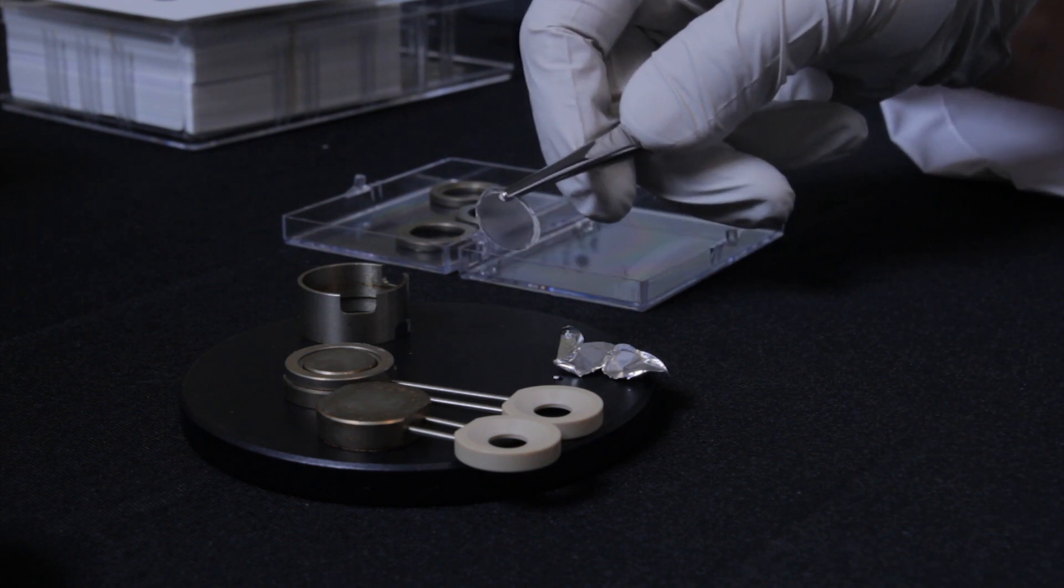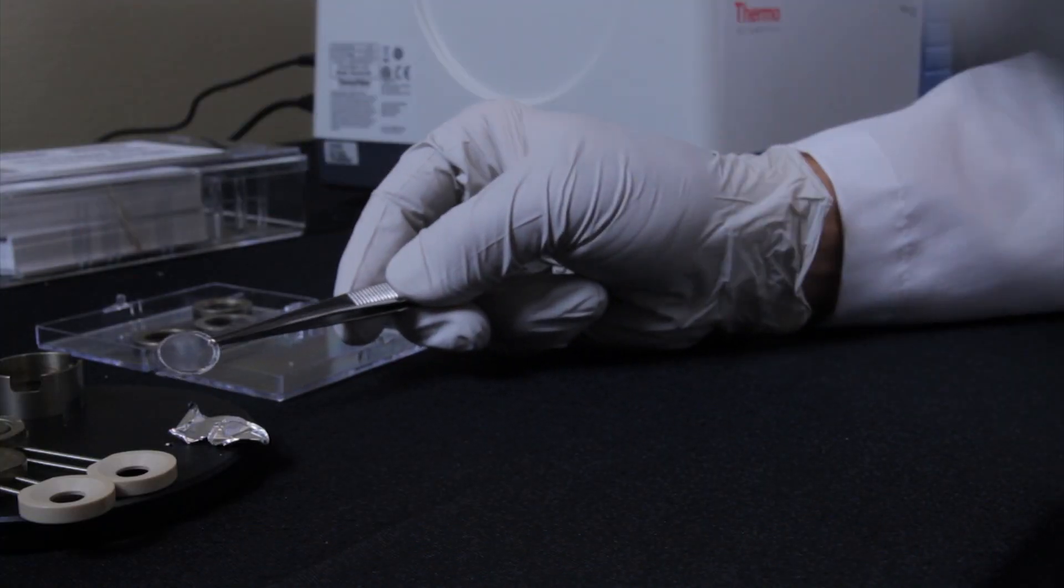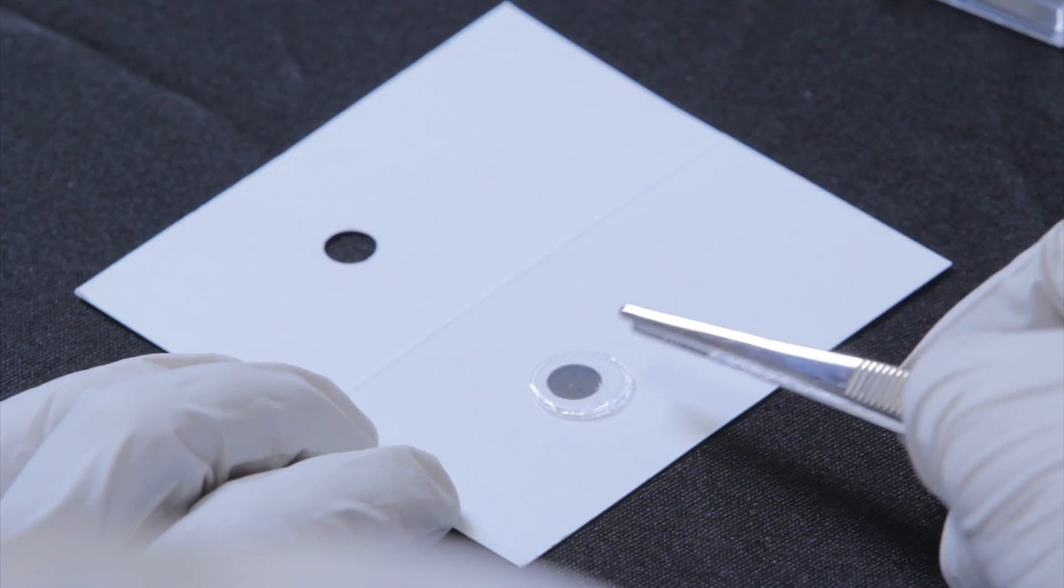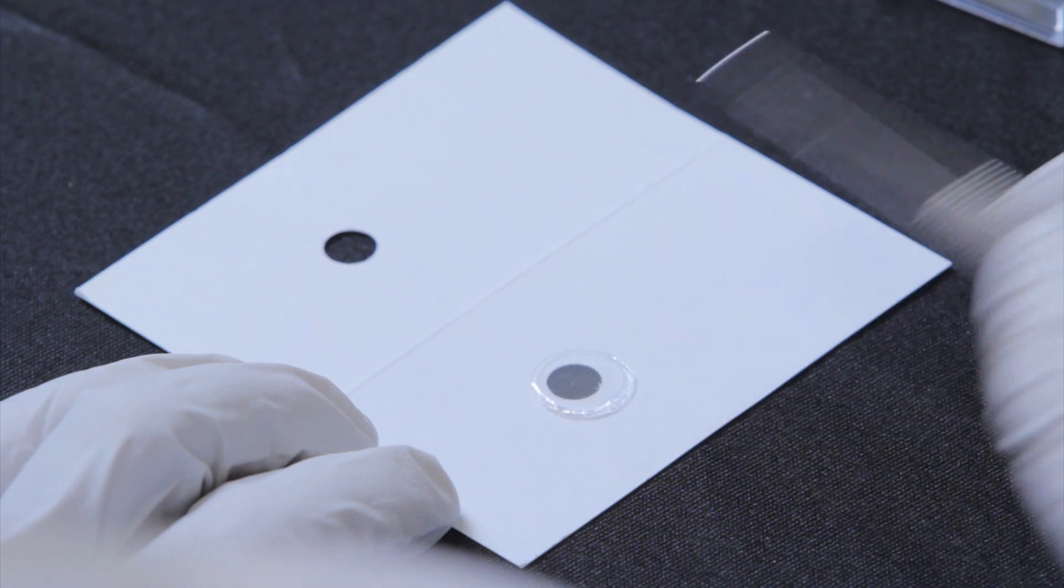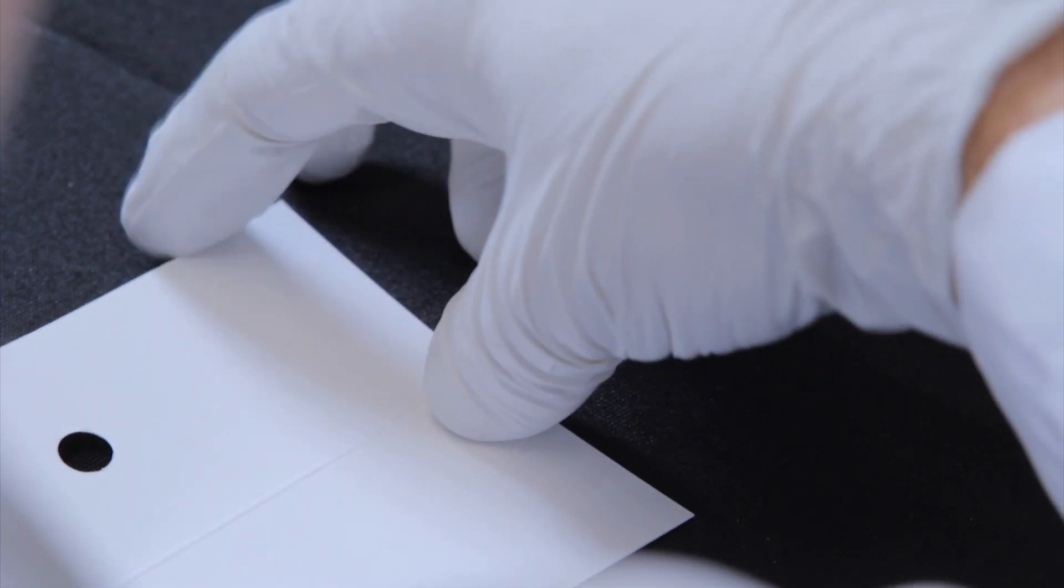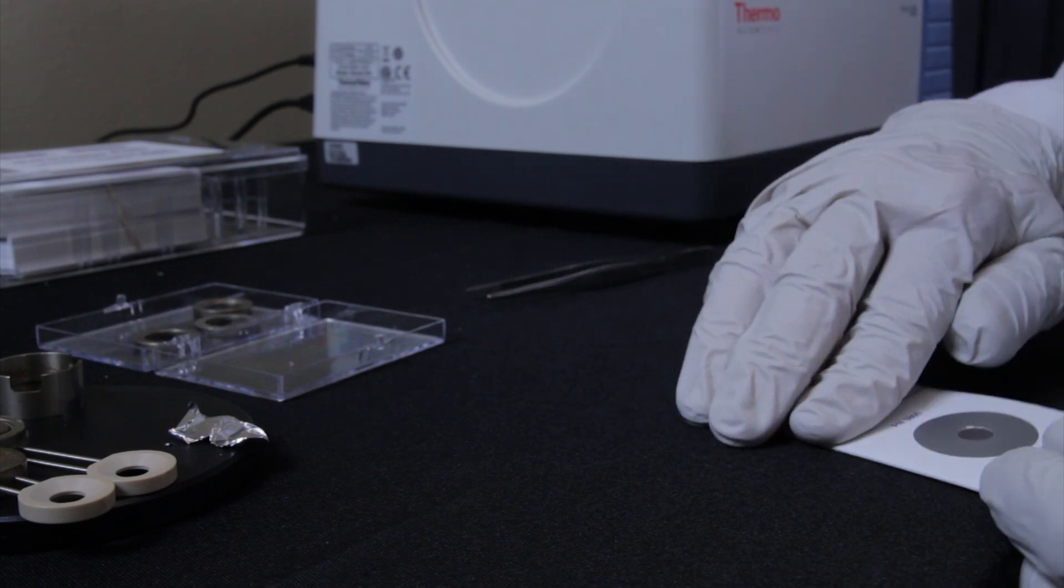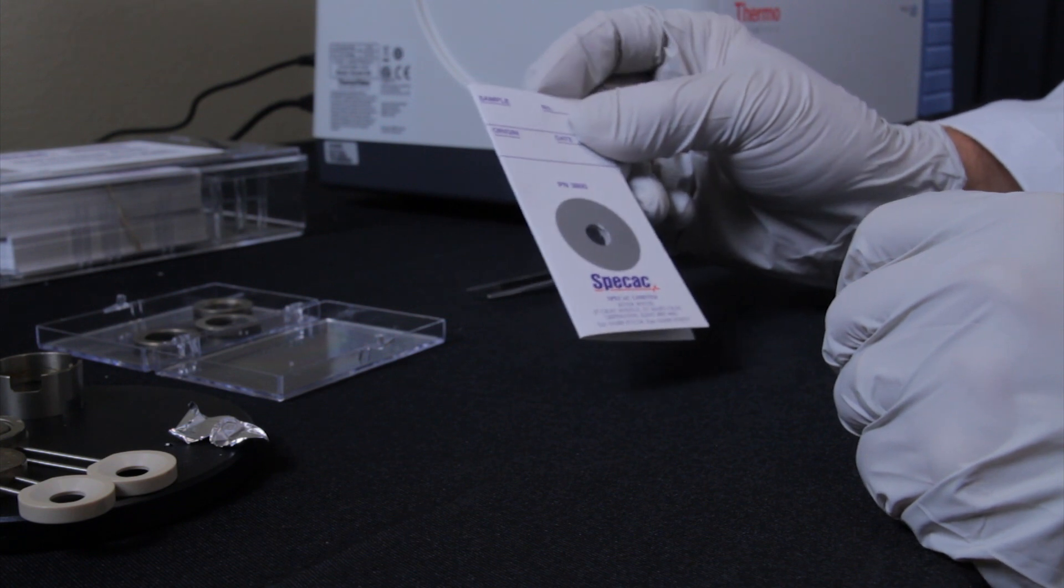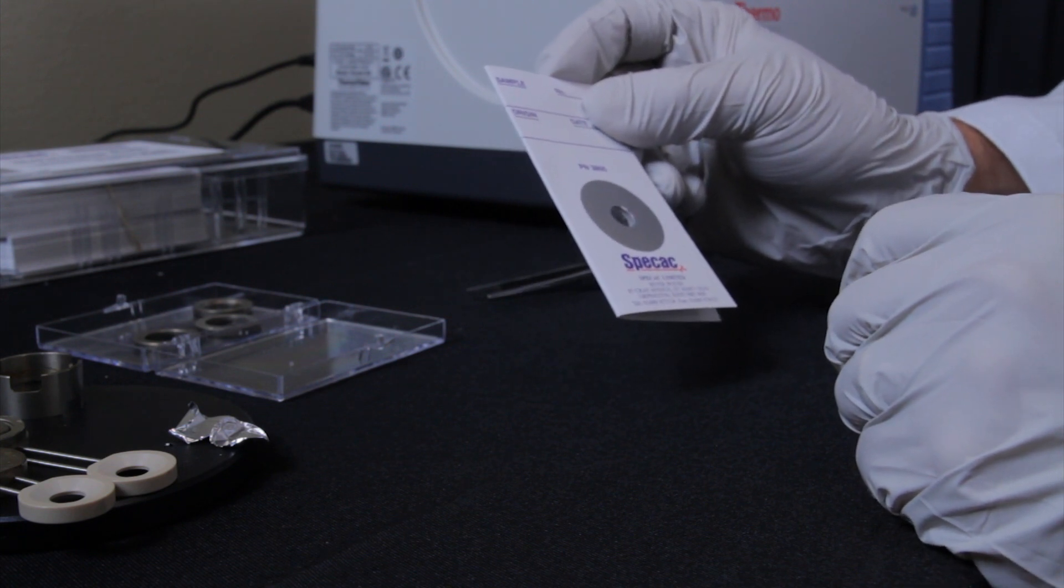This film can then be placed in a card for analysis. We line the film up over the hole of the card and fold the card over. This film in the card is now ready to be analyzed on the IS-5 spectrometer.